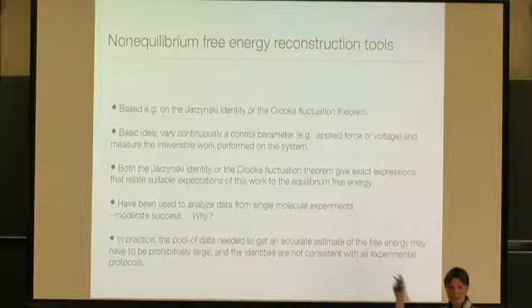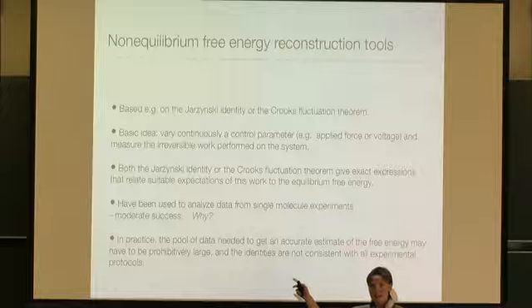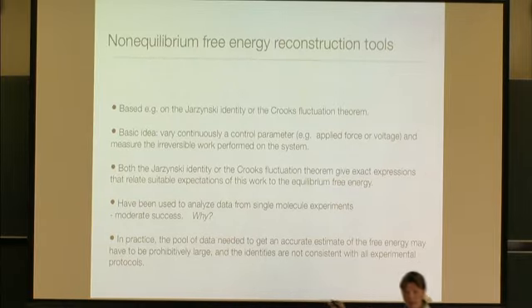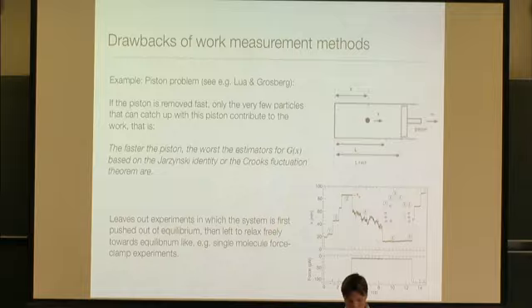The problem with this approach is that the amount of data you need is prohibitively large, in almost all the papers where you will see this being used, but particularly in our case, because we're doing instantaneous work, letting go at the time scale of the piezo. So we really don't have a hope in hell of using this method, and even in the cases where it has been used, the statistics are dubious.